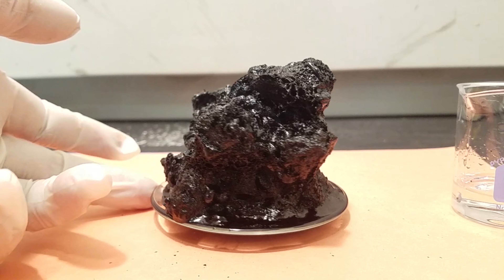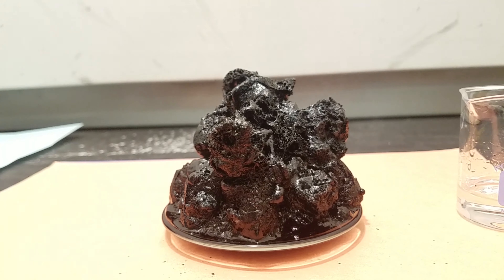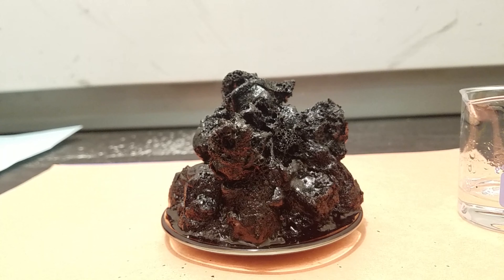We're going to look at it from all sides. If you show this to anyone, nobody would believe you that this used to be sugar.